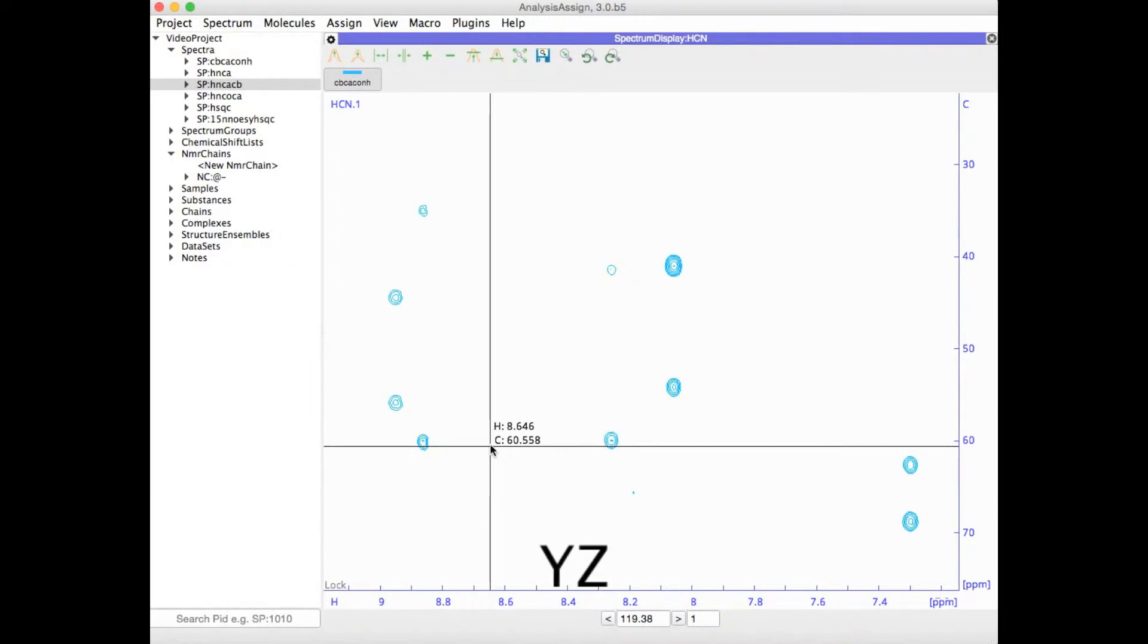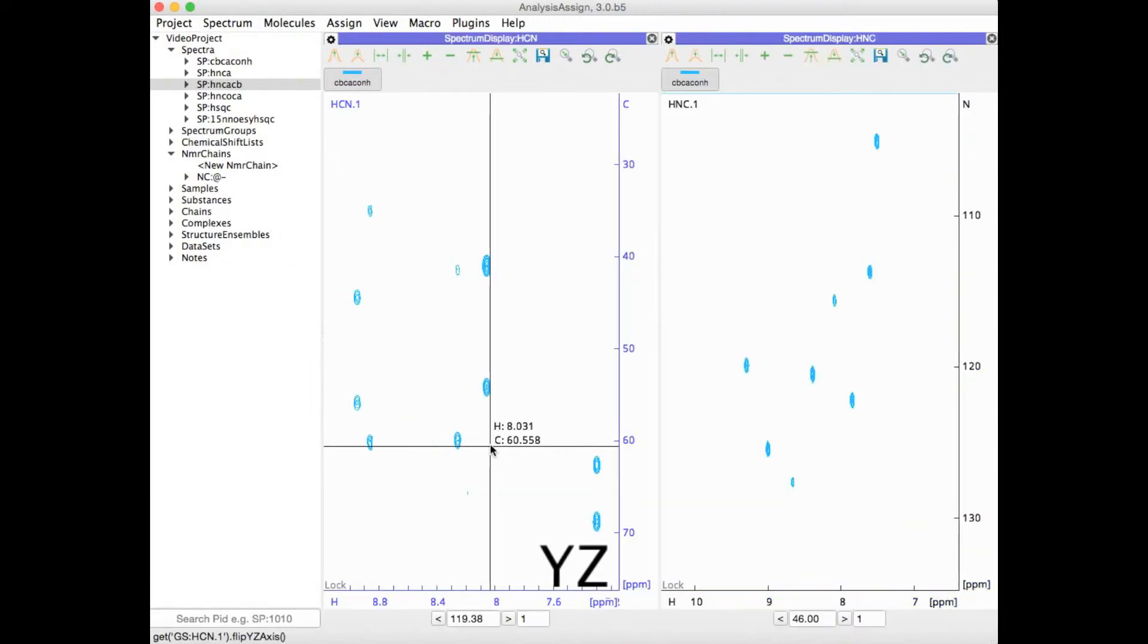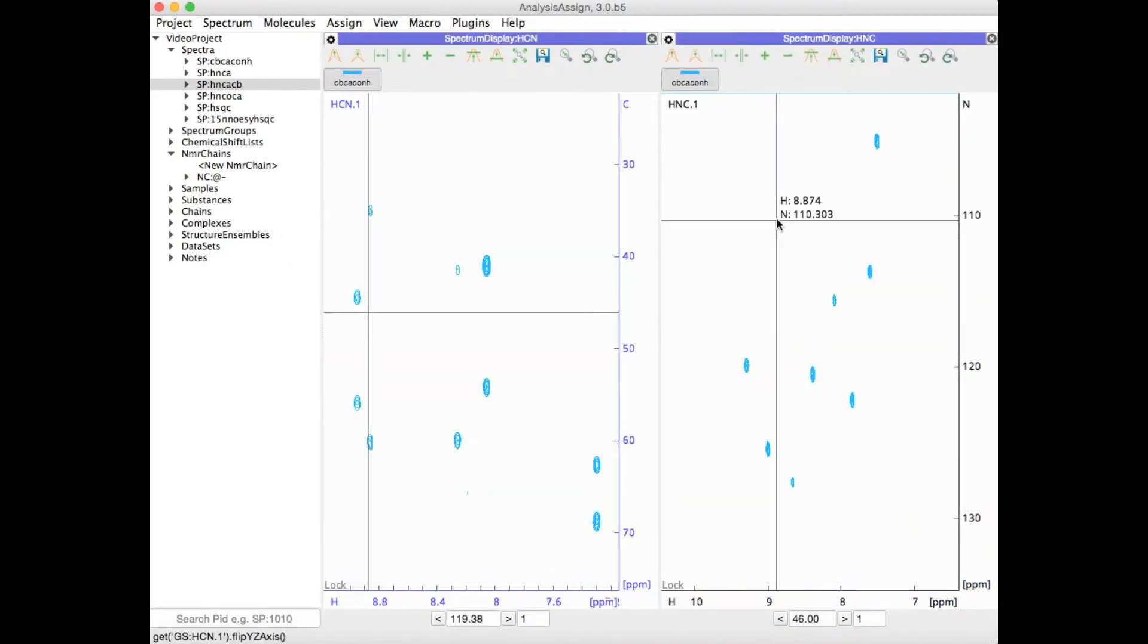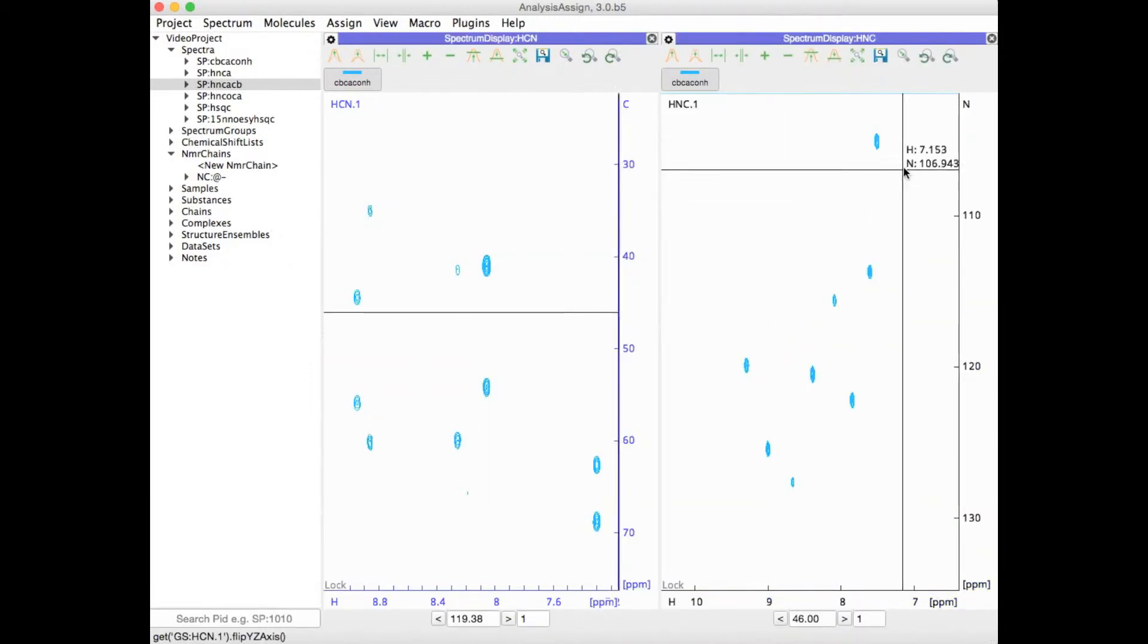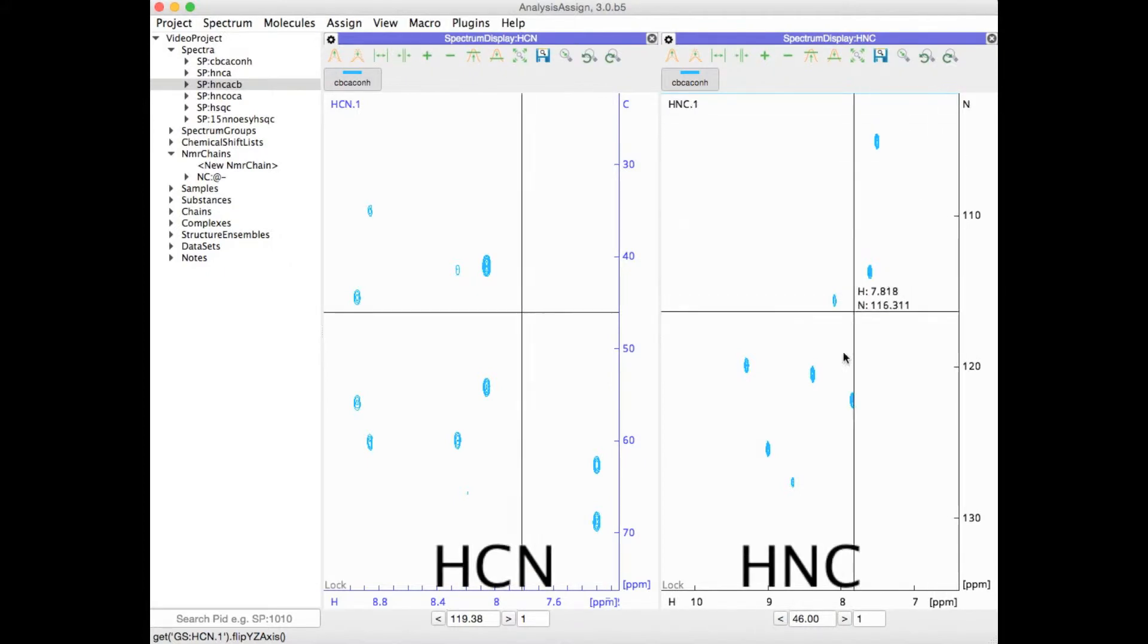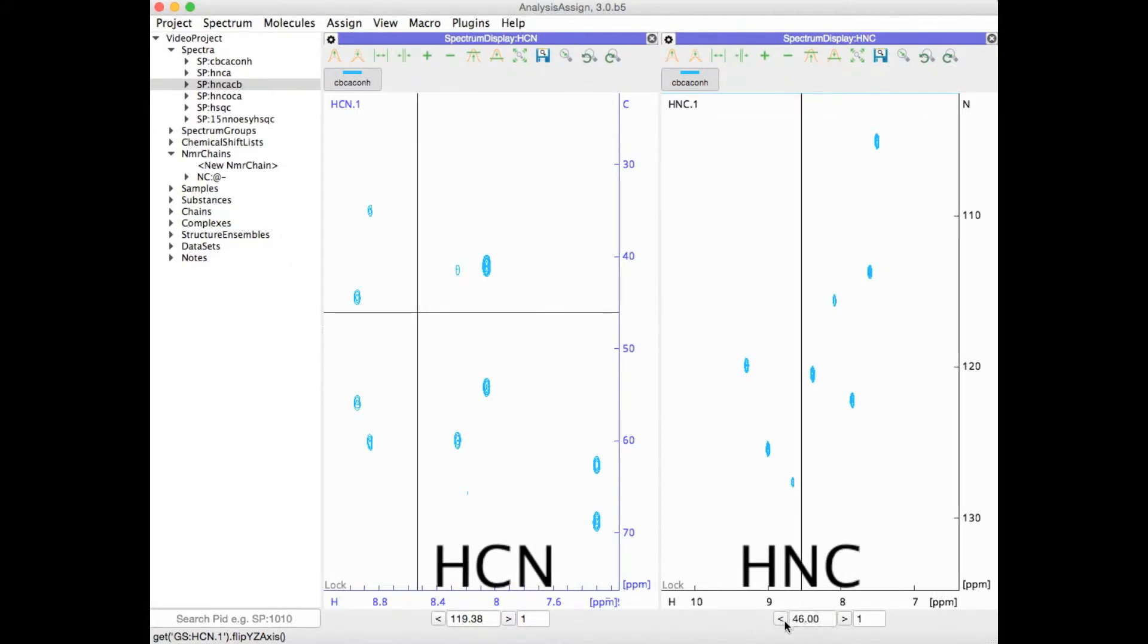If I now type YZ, it will copy the spectrum into a new module with the new axis arrangement where nitrogen is now in Y and carbon has been placed along Z.